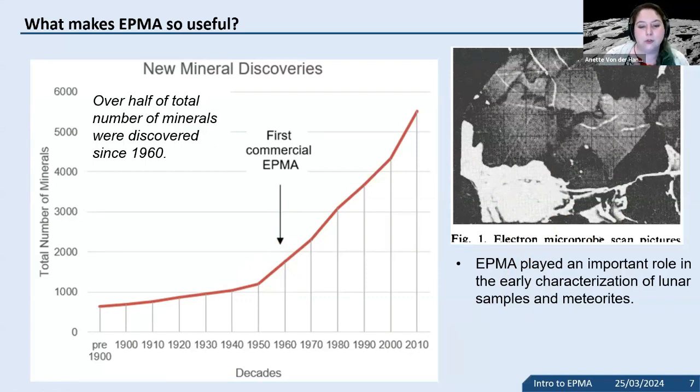And I should also mention that usually the electron microprobe is seen as non-destructive. So in comparison to laser ablation, where we actually remove material, and the same with SIMS, the electron microprobe is not destructive, and so samples can be analyzed again and again and again.